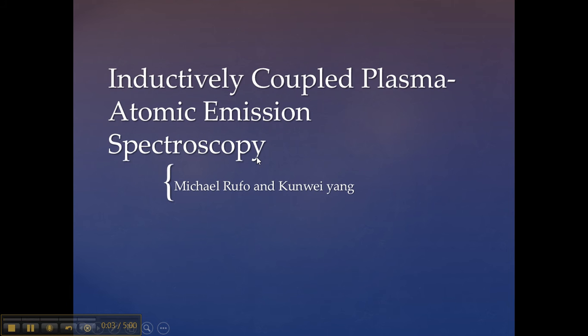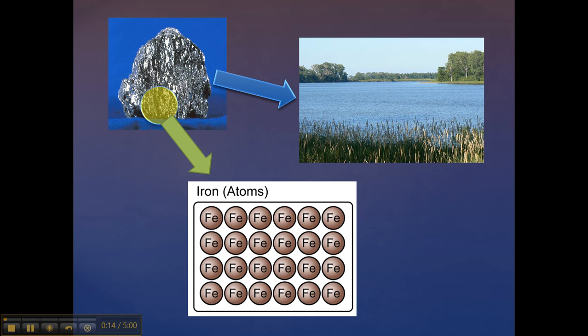My name is Michael Rufo, and today we are going to be talking about atoms, what makes up atoms, elements, and how we can use differences in element properties to learn what was inside your water samples. The water samples that you brought in for the experiment looked clear, as if there was nothing but water and maybe some dirt in them.